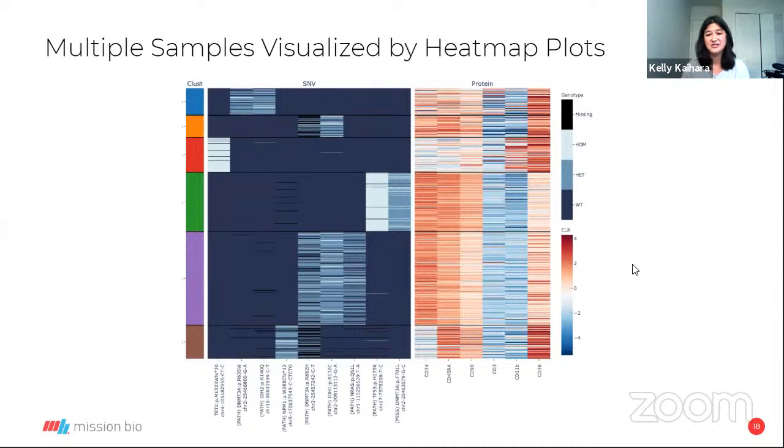And then finally, we did our demo on one sample. Tapestri Insights 3.0 can handle multiple samples, as does the Mosaic Jupyter notebook analysis package. Here, not only did we have the one patient sample, shown in blue, which has these two DNMT3A and IDH2 mutations, but in collaboration with Ross Levine's lab, we looked at six different patient samples, which are shown in these colors on the left.